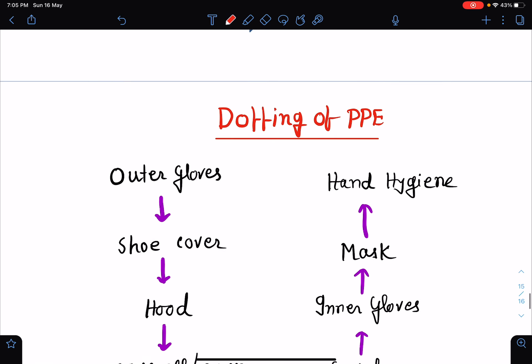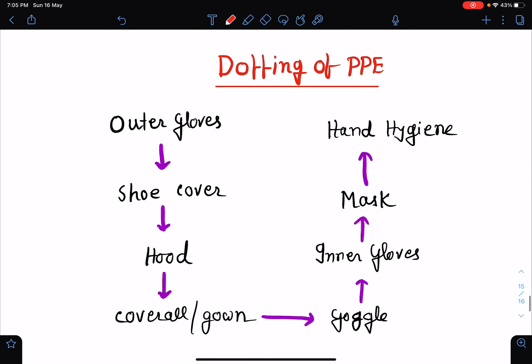Now doffing of PPE is also equally important. It should be done in a stepwise manner. It is very important because while doing doffing, there is a high risk of getting the infection. I just want to mention that in each and every step of doffing, you perform the hand hygiene or do the hand wash. First of all, you do the hand hygiene or hand wash with the outer gloves on.